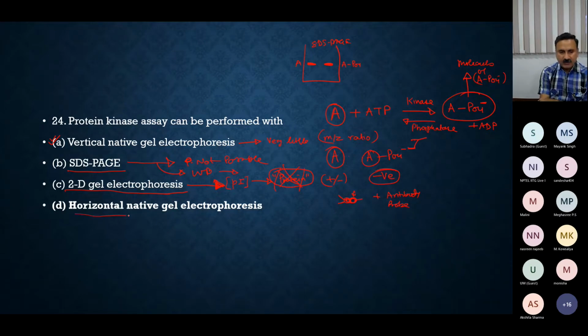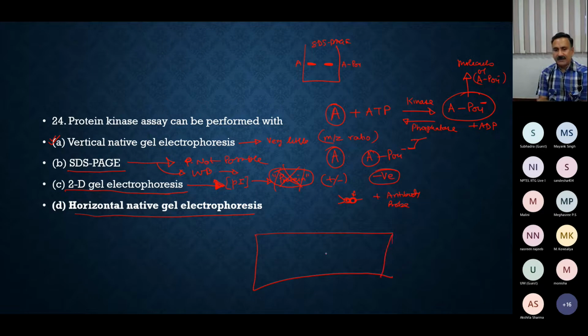Now let's talk about the horizontal gel, which is actually the correct answer. Now horizontal PAGE, what we said, okay, this. You are actually going to load the sample in the middle, right?